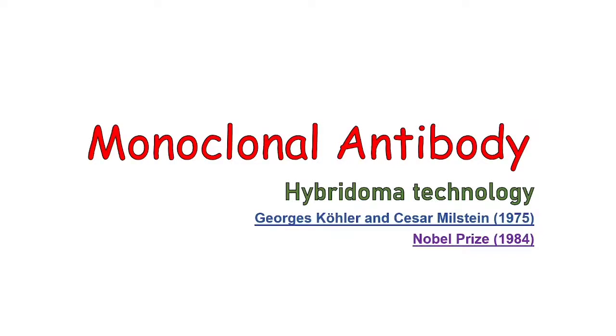In this video, we will discuss how monoclonal antibodies are produced by Hybridoma Technology, and what Hybridoma Technology is. George Köhler and César Milstein invented the Hybridoma Technology in the year 1975, and they got the Nobel Prize in 1984 for their discovery of hybridoma technology.